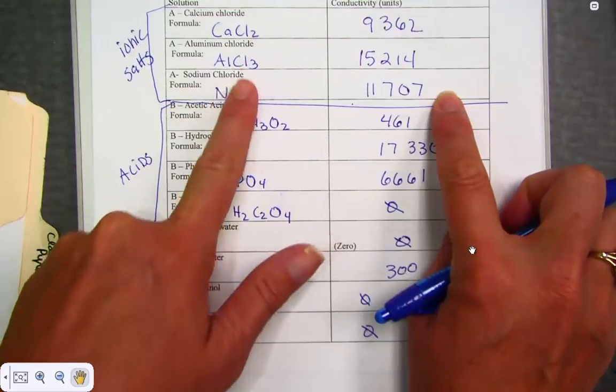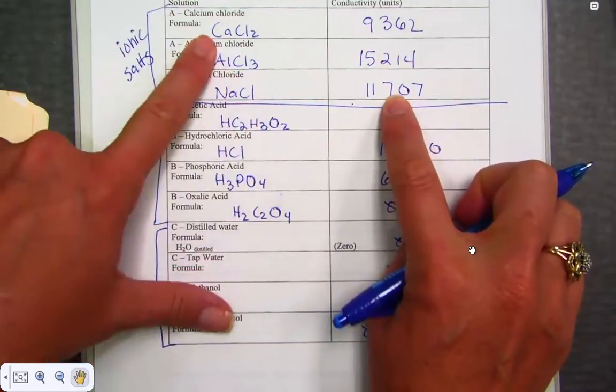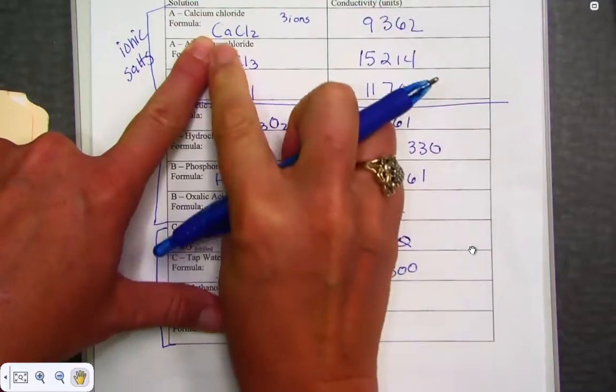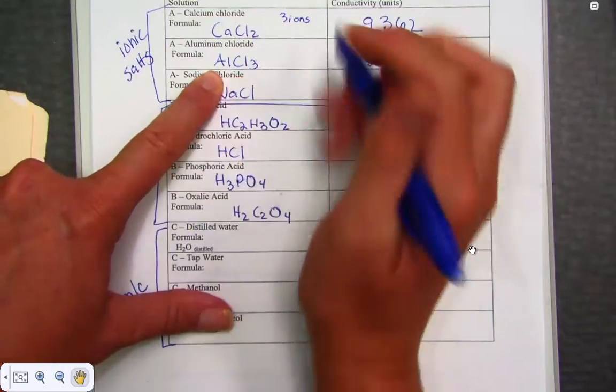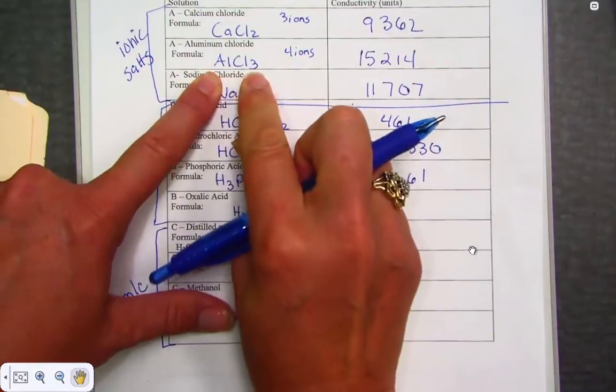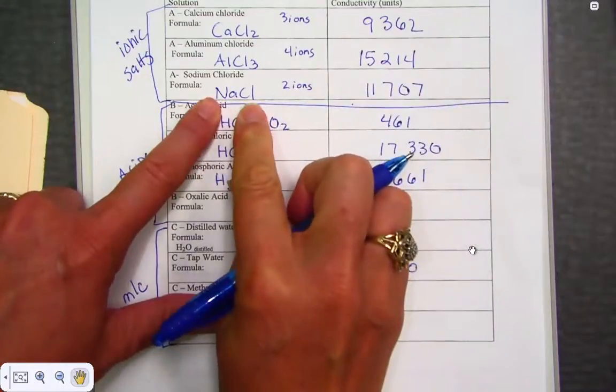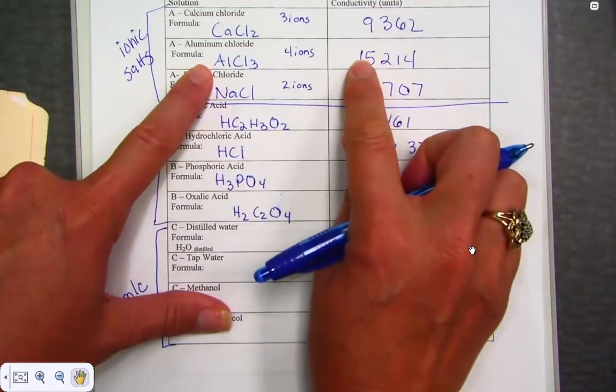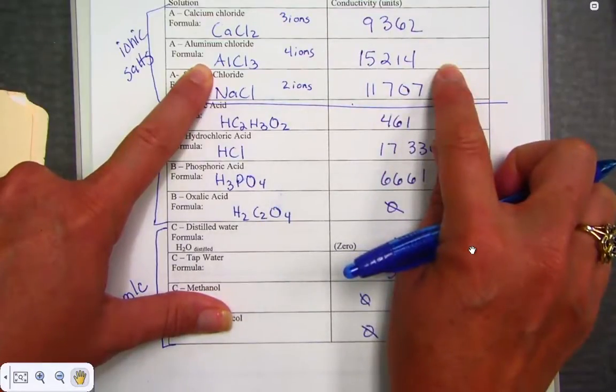I noticed that the number of particles that would dissociate also plays a role in the value that I've recorded. For instance, when calcium chloride dissociates, breaks apart into its ions, I realize that I'm going to get a total of three ions in solution, one calcium and two chlorides. When aluminum chloride dissociates, I'm going to get a total of four ions, one aluminum and three chlorides. And here, sodium chloride, let's go into two ions, one sodium and one chloride. Notice how our conductivity readings verified that the more ions we have in solution, four, then three, then two, the higher the conductivity, the brighter the bulb would indeed glow.